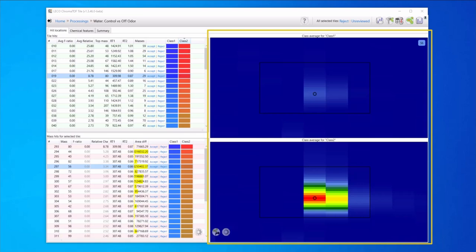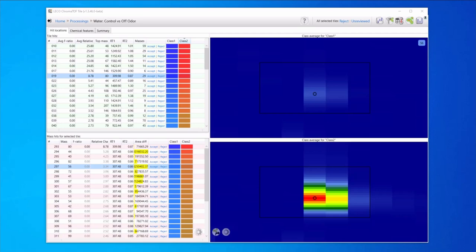This view is showing the selected window from the top panel and the selected mass from the bottom panel. We can review and interact with the data from here, and we can also curate features to add to the chemical feature table.